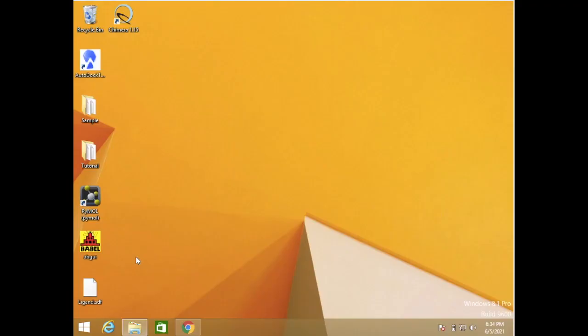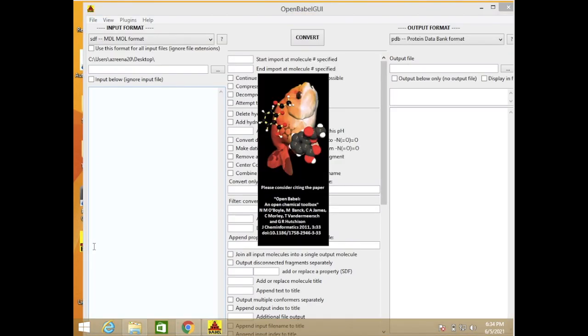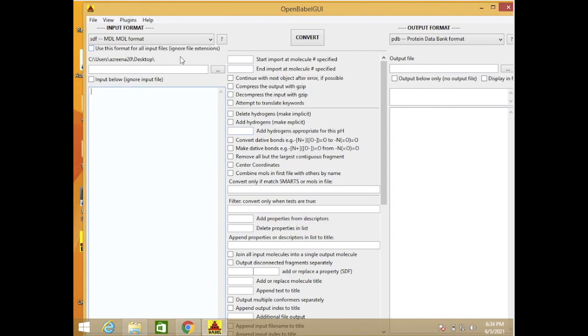Conversion using OpenBabel. We click the OpenBabel icon here. There are three parts: which is input part, convert part, and output part.